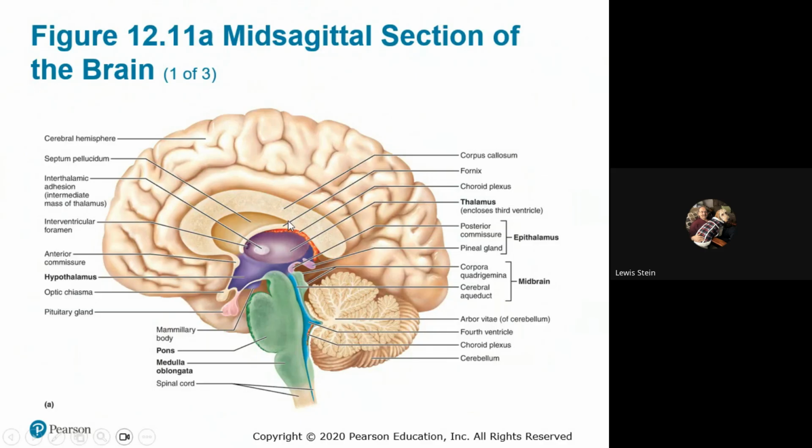As you're above here, you're going to see this opening where the lateral ventricles are, and it's filled with fluid. You'll be able to probe in there once you slice down and see this view. Surrounding this is the third ventricle. You'll be able to identify that. You're going to see little blackened stuff.